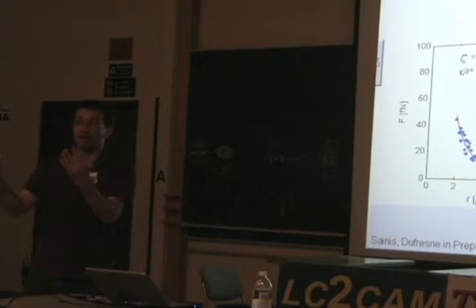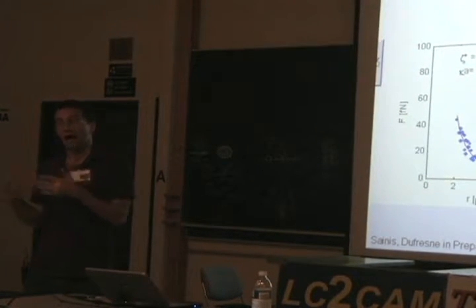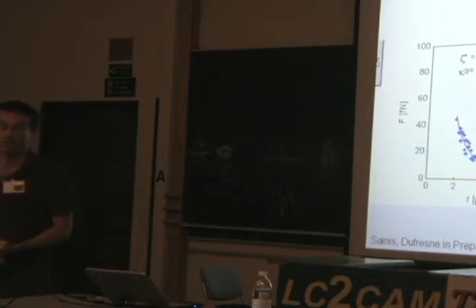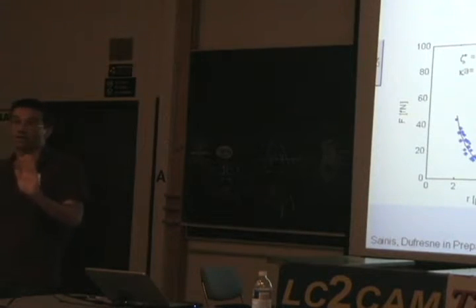And the specific value of the index of refraction at the operating wavelength for both of those materials matters, right? So you need to make sure that at the wavelength of your laser operation, not only are you not heating up anything, but you also are working where the index of refraction mismatch is favorable.